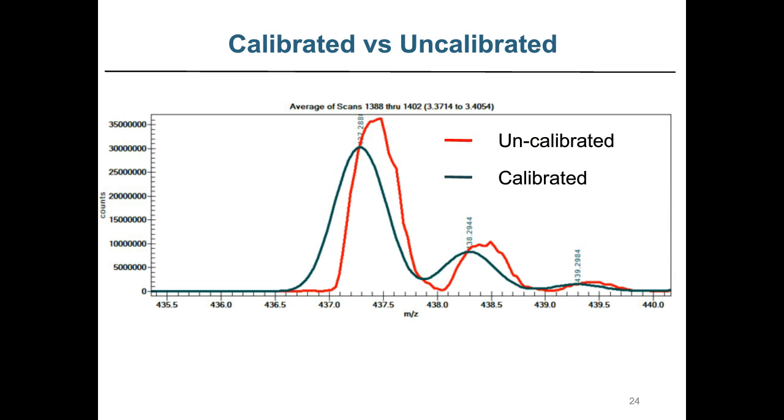And just a visual here, this shows the uncalibrated data from this particular LCMS system compared to the calibrated data. Again, it's very apparent that we've not only calibrated to accurate mass, but perhaps more importantly, we've also calibrated to a proper line shape.